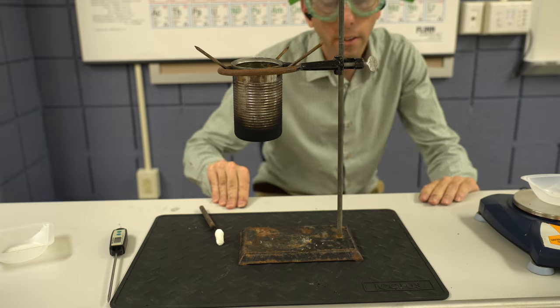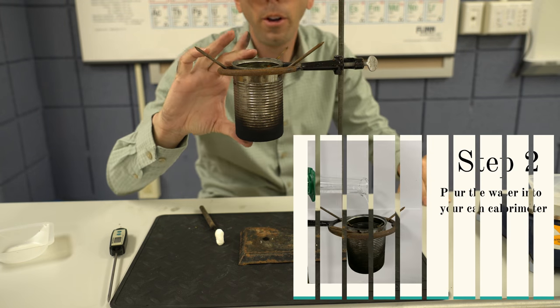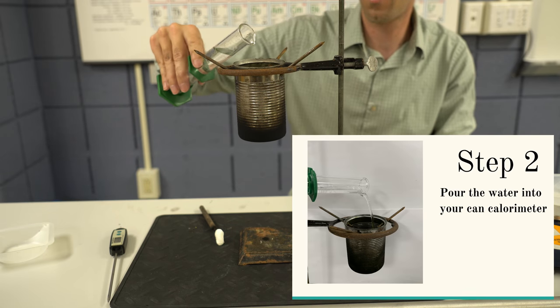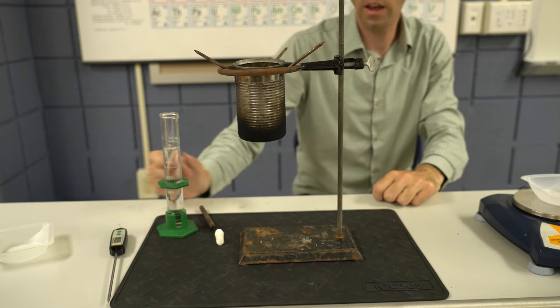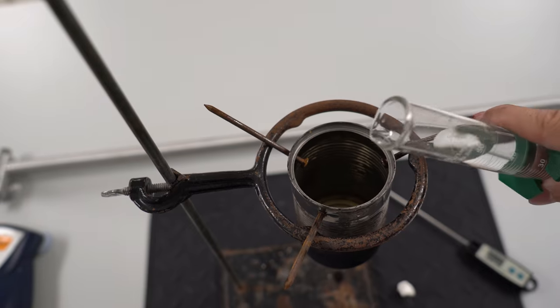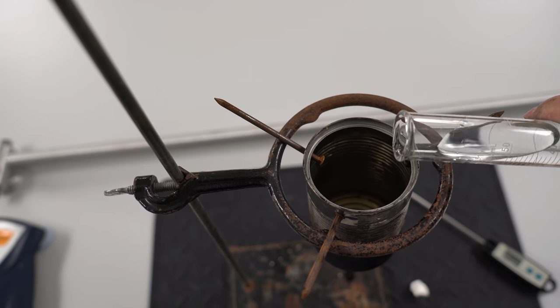Okay, so now our next step is going to involve putting the water here in our can. So I'm going to go through, add our water right to the can that way, and then we're going to take the temperature of that water. Taking our 50 milliliters of water and adding it to our can right there.